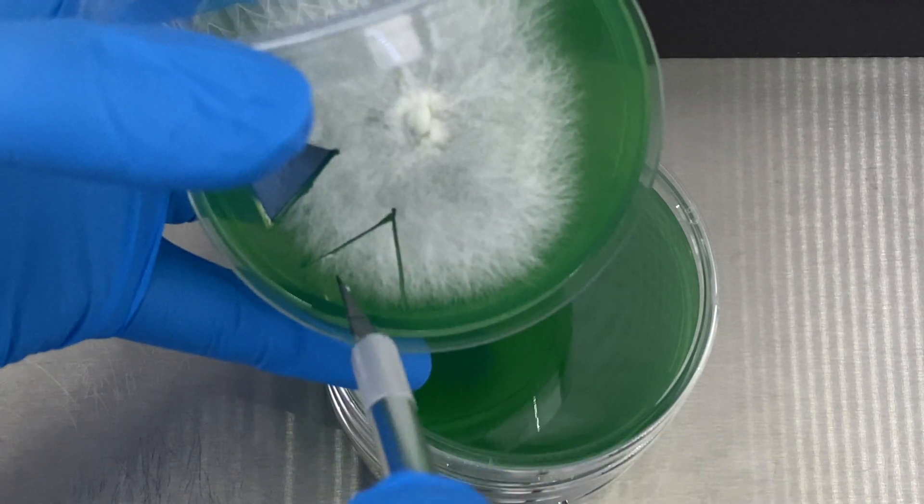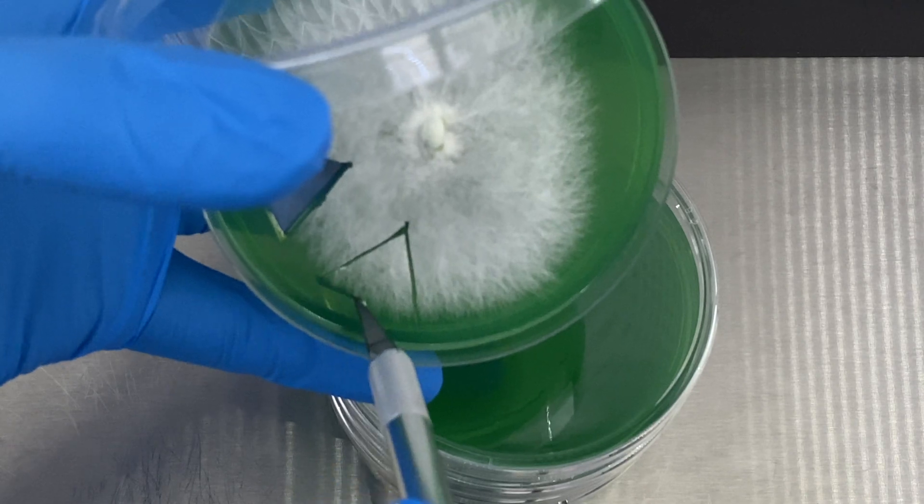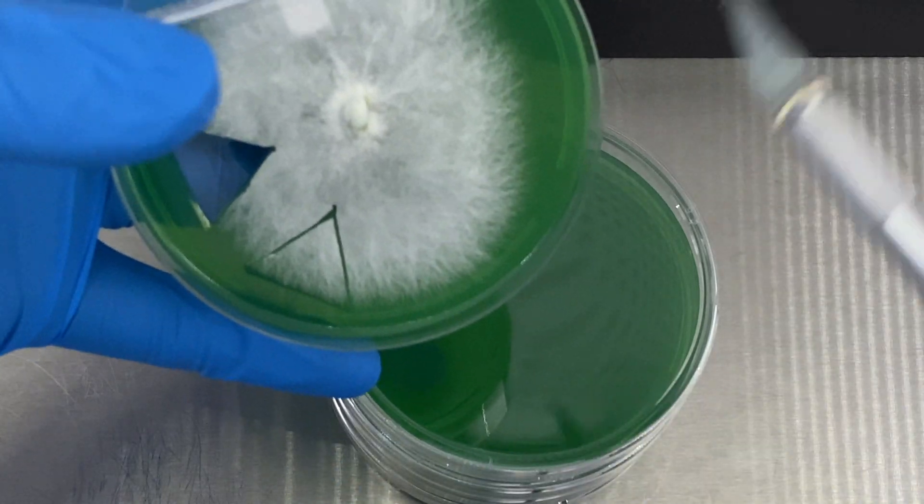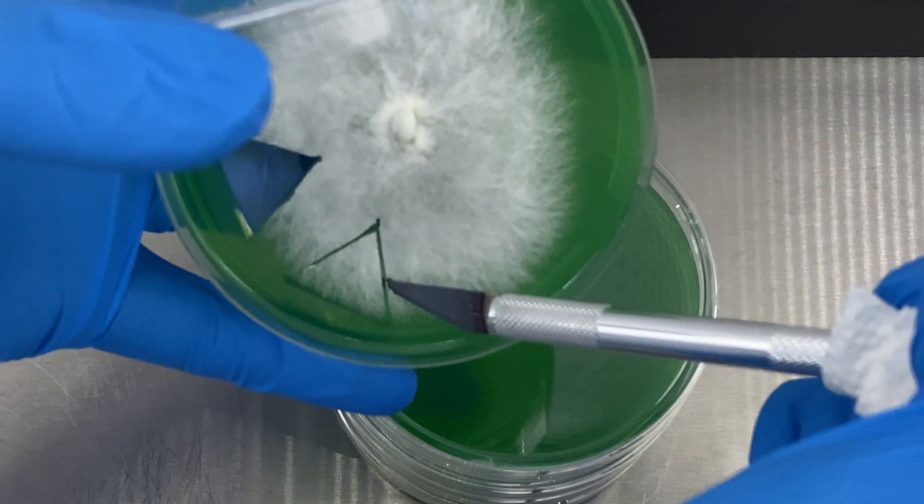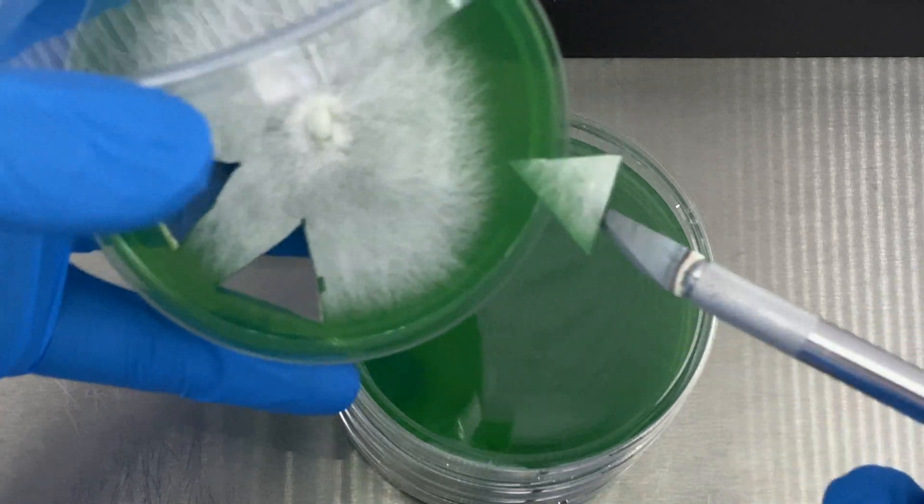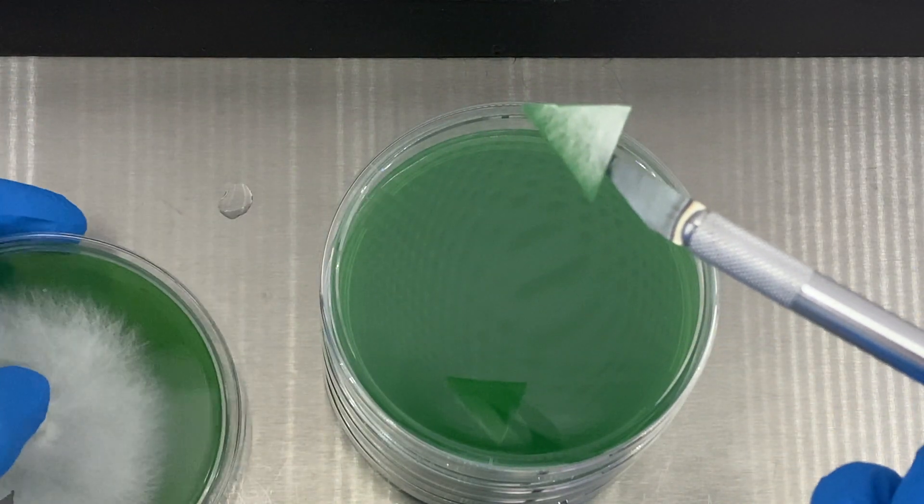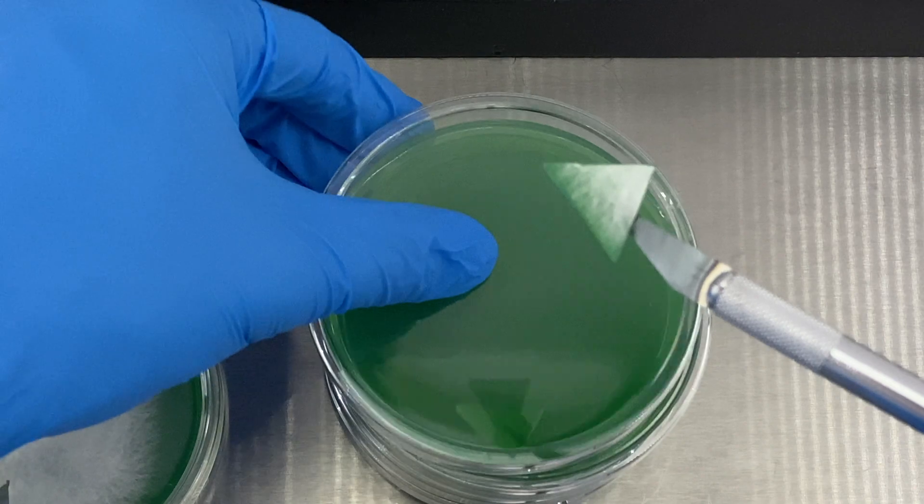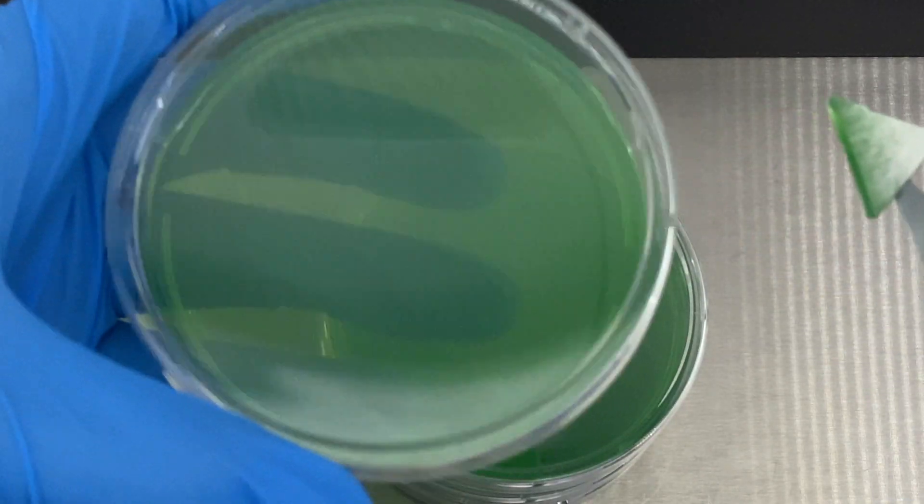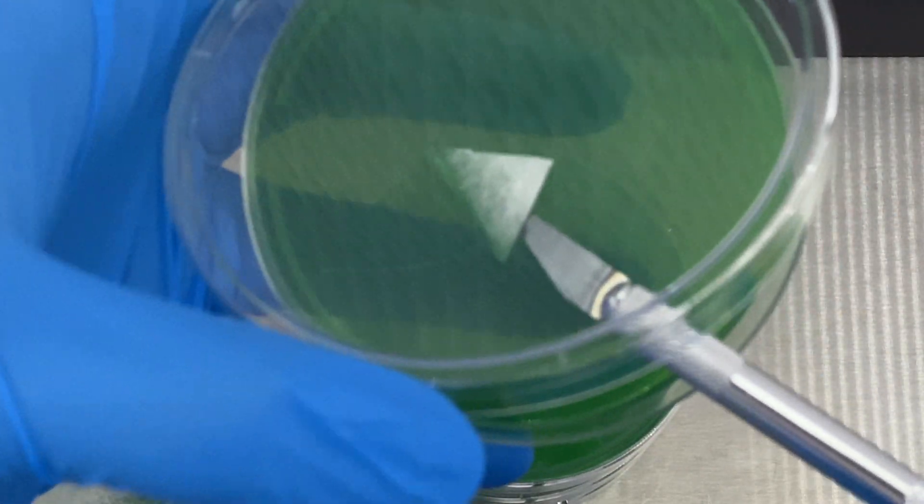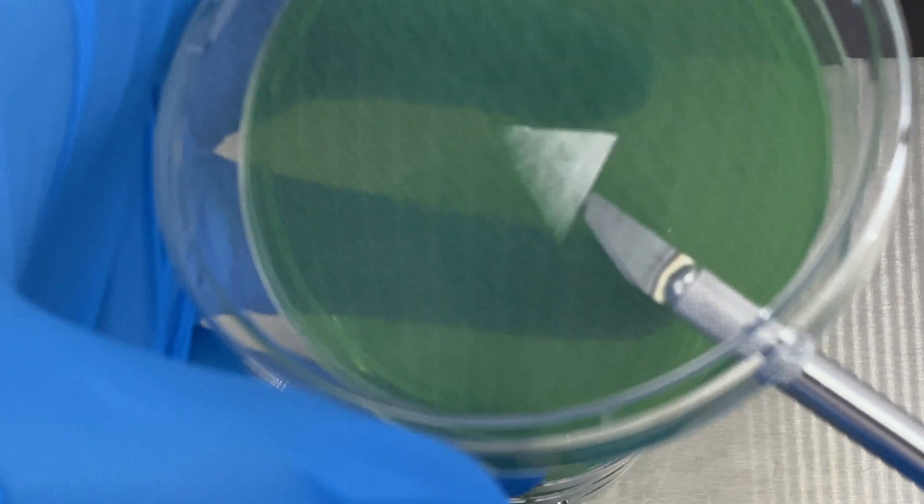We're going to follow the similar process where we're going to be doing a triangle shape coming from the inside of the culture until the edge where it is colonizing. I try to go a little bit inward so I can pinch the triangle shape that I'm going to be transferring over to the next plate.